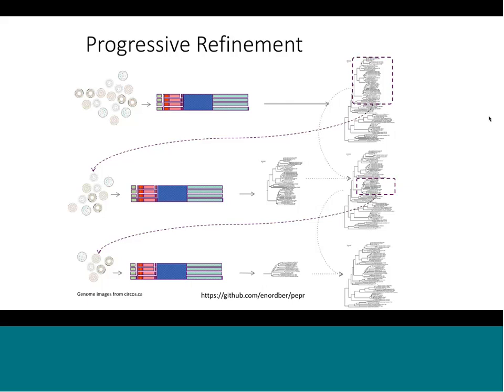However, if that branch is poorly supported and that particular clade is selected for progressive refinement, you could conceivably bring in more protein families to add more support to those specific genomes within that tree. So it'll create this, let's call it a subtree. And then this subtree, the pipeline will insert the subtree back into the main tree, replacing the weak branch with the next branch it is made.